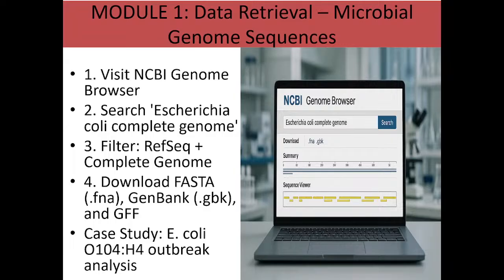That is, how can you retrieve data, that is microbial genome sequences. So on your screen, the first thing is that you visit NCBI Genome. This is time to listen and watch. This is not the time to do the activities, but it is the time for you to listen, watch your screen, and follow the steps. So you have to visit NCBI genome browser, and by now you know how to do that.